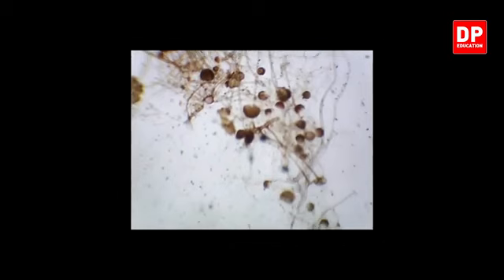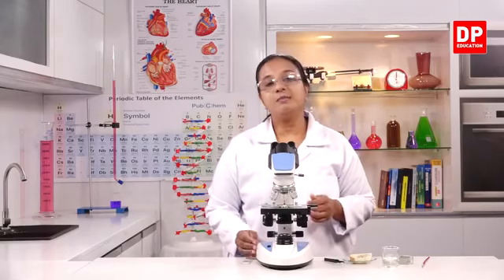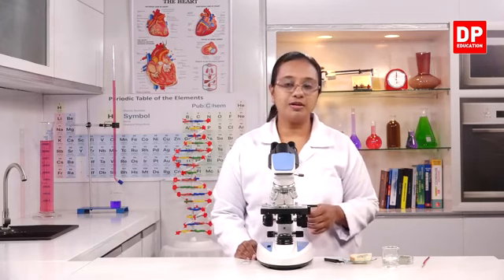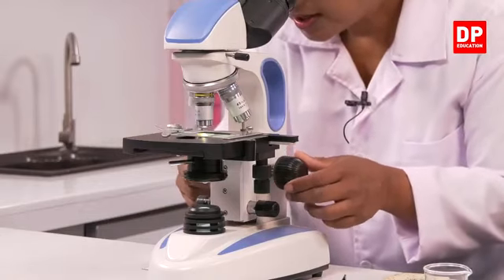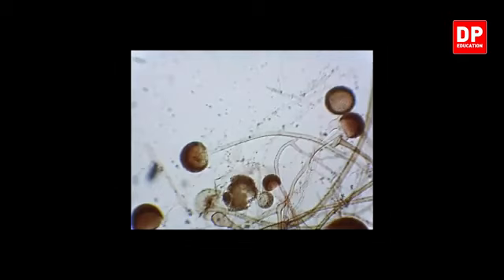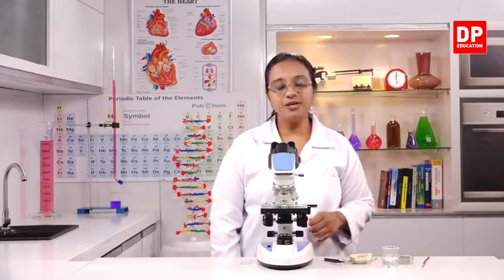Yes. So if we observe this through the microscope, you can confirm that the microorganism, that is a fungus called mucor, has grown on bread. The same thing can be observed under medium power also. So if I adjust it there, now can you all see it more clearly? Can you identify the shape of the microorganism? Yes. So there you saw what mucor is, and you know it grows on bread.